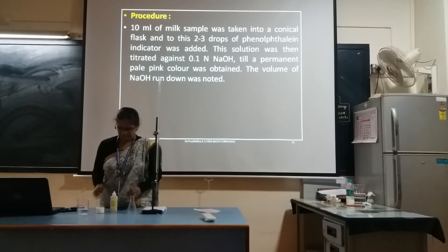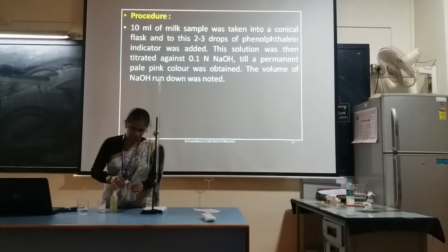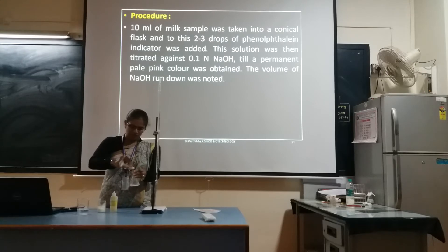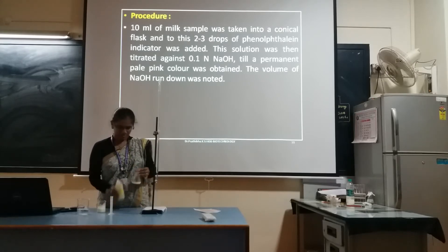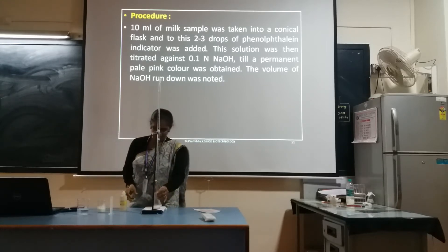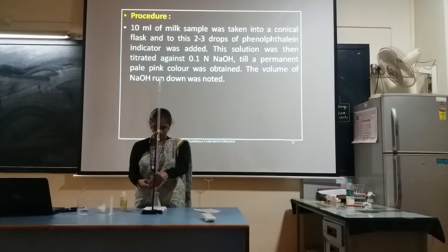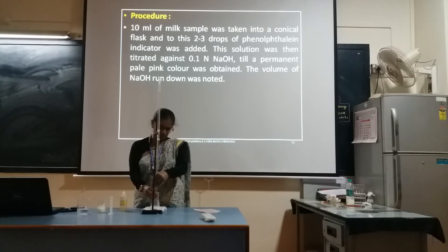I have taken the conical flask here. Let me measure the milk sample for 10 ml. I have taken the 10 ml milk sample — put it in the conical flask, then add 2 to 3 drops of phenolphthalein indicator. Then titrate against the NaOH, adjusting the burette to release drop by drop into the conical flask.